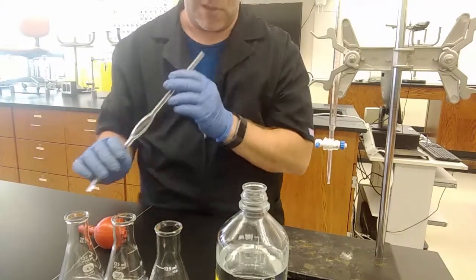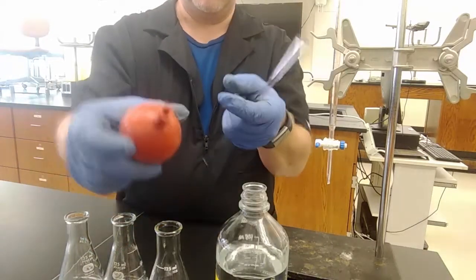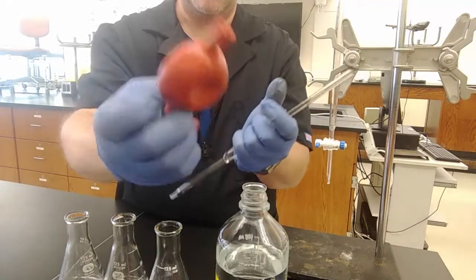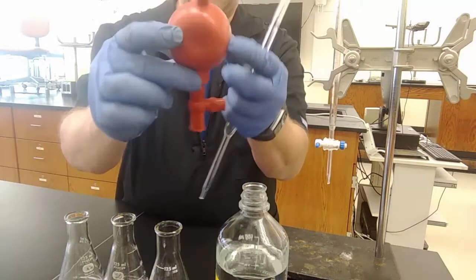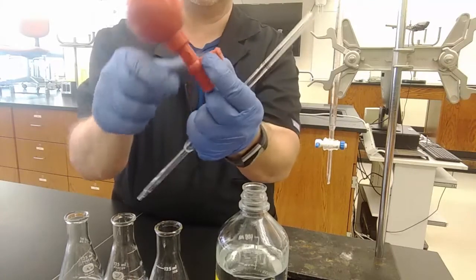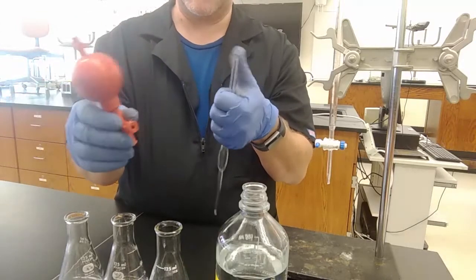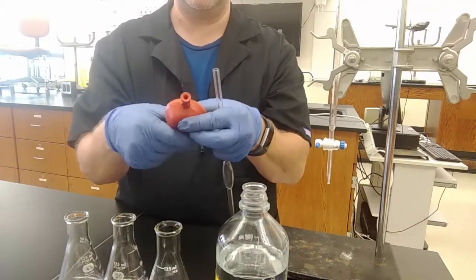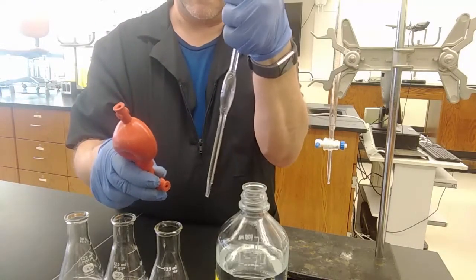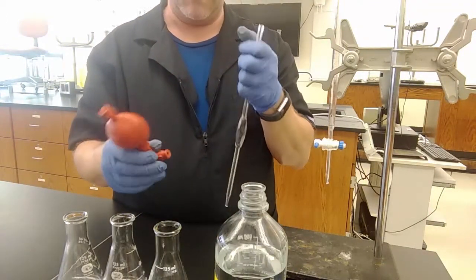Never suck anything up in the lab, and certainly never put your mouth on there and try to suck it up. That's bad news. So you're going to use your pipette bulb. Whichever valve you squeeze, that's where the air can come out, so the air can come out the top that way, and now it's ready to suck stuff in. If I squeeze this valve right here, that will suck air up that way, and if I squeeze this valve, that lets air in that way, which would allow the pipette to drain. I'm halfway old school using this type of pipette bulb. I like to suck it up with the bulb, and then put my finger on the top of it to get it exactly on the line and let it drain out. You can use the bulb to let the water out, just not the way that I'm comfortable with.